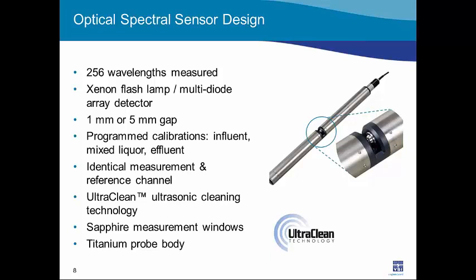In observance of Lambert's law, this particular version comes in 1 millimeter or 5 millimeter gaps, which are applicable to different applications. Recall that the longer the gap, the lower the intensity at the detector.